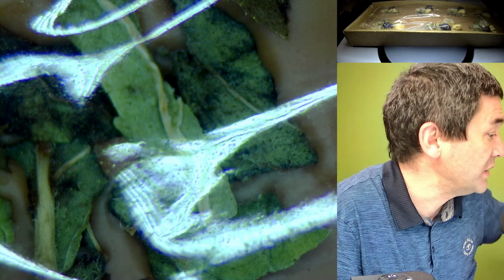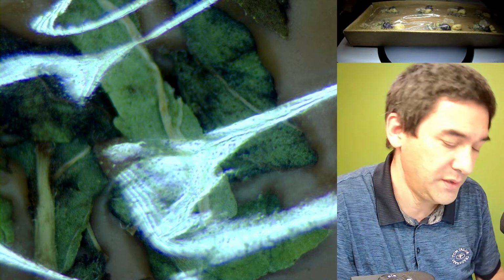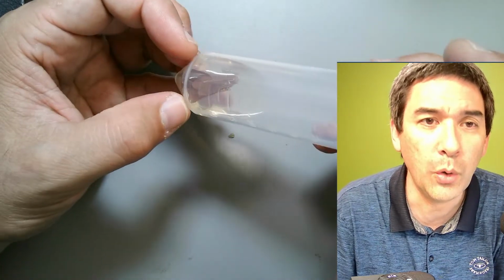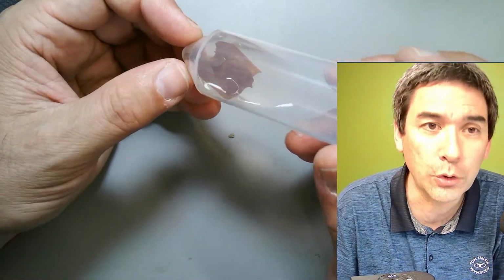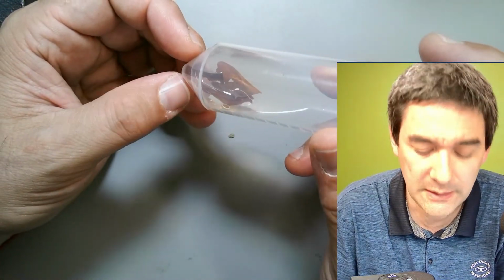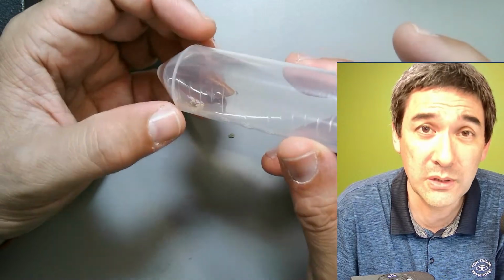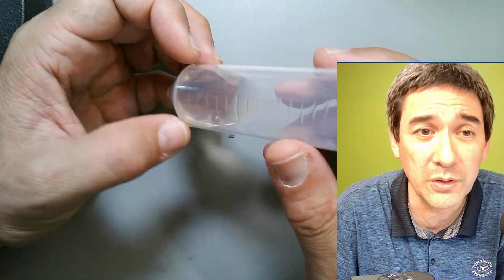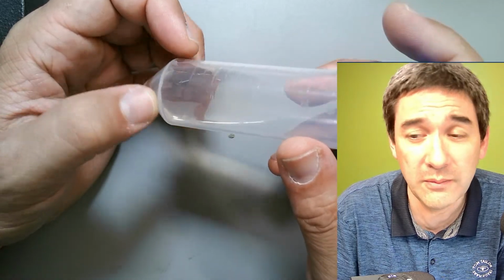Just want to show you something else as well. This here, I just switch over. Again, these are oak leaves that I put into alcohol for preservation. I would like to cut them in cross sections, but it's a little bit difficult to do. So I'm still working on a technique for actually doing that.